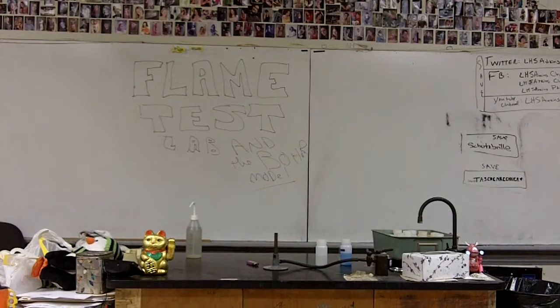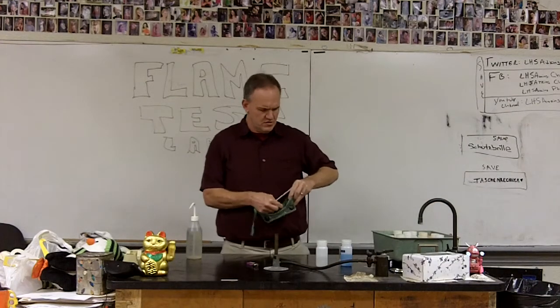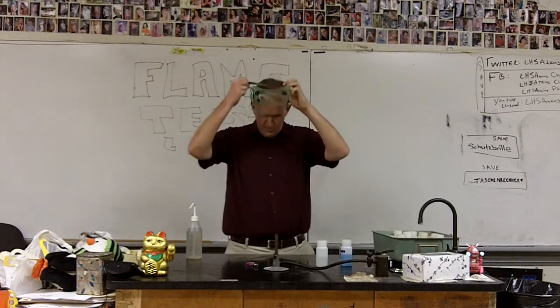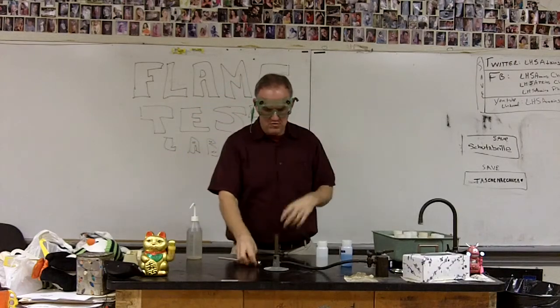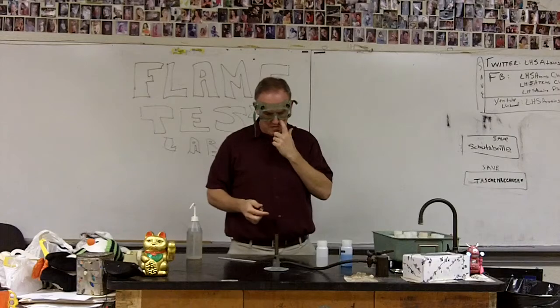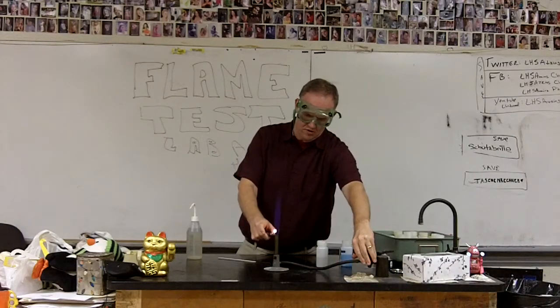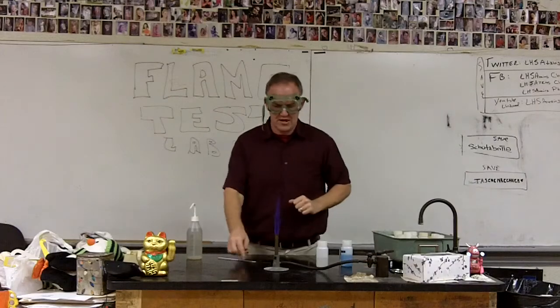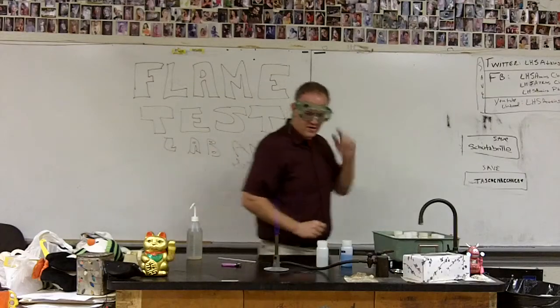For this lab, what you're going to need — as with any lab where we're going to use fire and chemicals — is a pair of safety goggles first. And we will light our Bunsen burner. Light it first, turn on the gas, and make sure we've got a good strong blue flame.